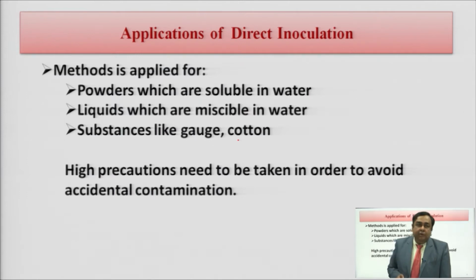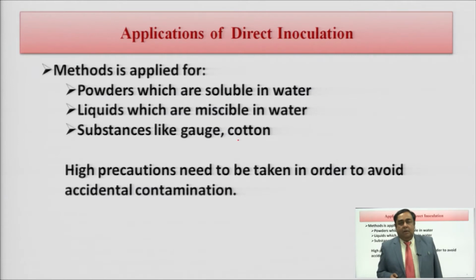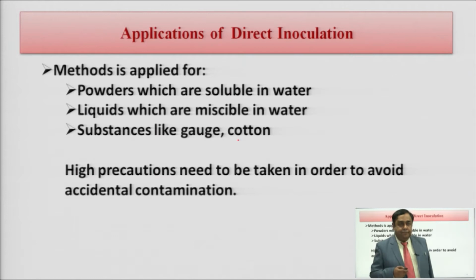We use them for liquids which are water miscible in nature. We also use them for various solid substances like gauze, cotton, catgut, syringes, and so on.